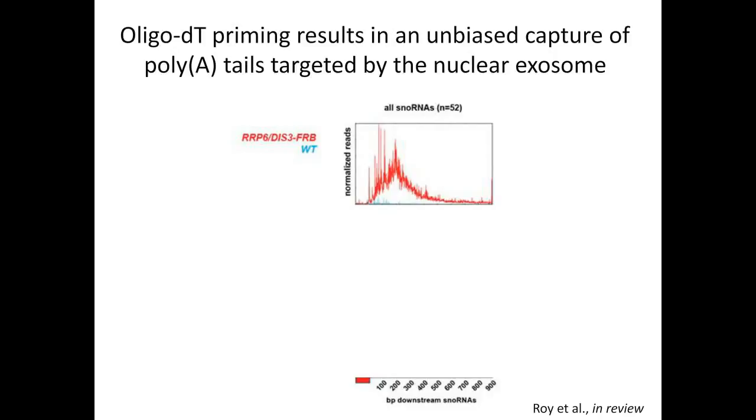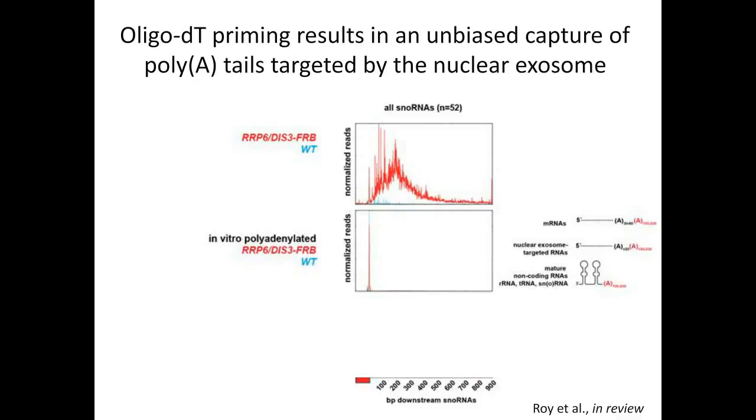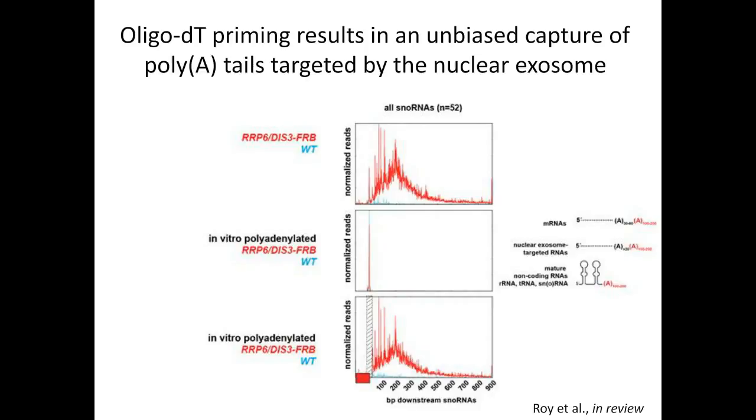And so first, if we look at the signal downstream of the snoRNAs, when we inactivate the nuclear exosome, we see a number of peaks that seem to have the highest level of signal in the 200 to 300 base pair region downstream of the snoRNAs. And what we did was, after we in vitro polyadenylated all of the RNA, we see that now by far the most predominant signal is the mature 3' end of these snoRNAs, and that's because most of the snoRNA in the cell is mature, fully processed snoRNA. But if we block out that signal and instead look at the nuclear exosome targeted poly-A signal, we can see that the in vitro polyadenylation treatment reveals a remarkably similar profile of these unprocessed 3' ends.